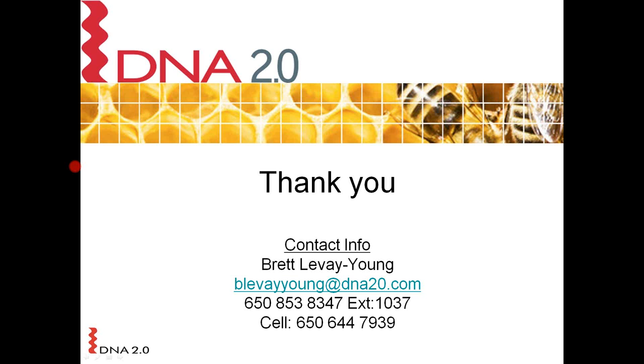And those might be areas where it would be useful to then do a smaller alanine scanning library, perhaps with anywhere, and I'm again making stuff up, 30 to 100 different residues where you would substitute alanine and ask, what effect does this have on my protein?